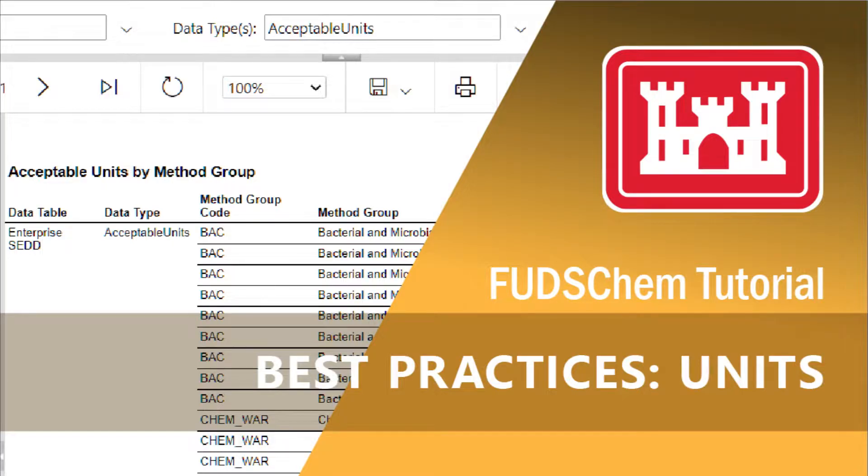This video will go over best practices for units in FUDSCHEM. When data is approved in FUDSCHEM and the data usability assessment is completed, the data is transferred behind the USACE firewall to its final home in the ECEM database.